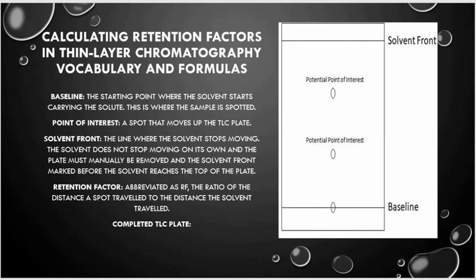In this we have the baseline and the point of interest. The baseline is the very starting point where the solvent starts carrying the solute, and this is where the sample is spotted. This is the baseline. Then we have the point of interest, a spot that moves up the TLC plate, which is known as the point of interest.